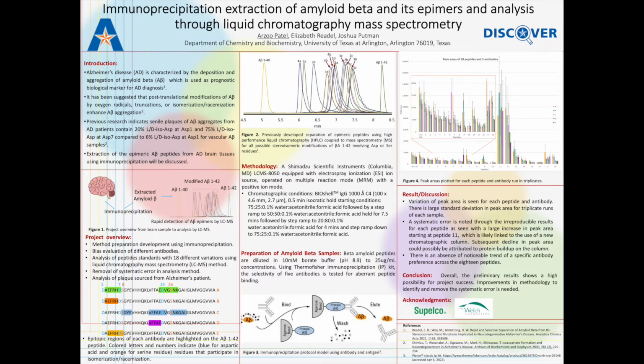Hello everyone, my name is Arzoo Patel and today I'm going to be talking about the extraction of amyloid beta and its epimers and analysis through liquid chromatography mass spectrometry. I've been working on this project in Dr. Armstrong's lab along with a few other lab members.